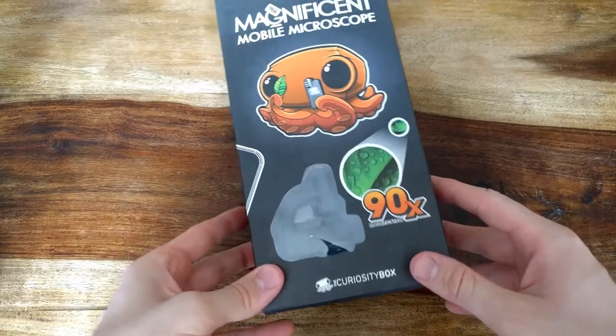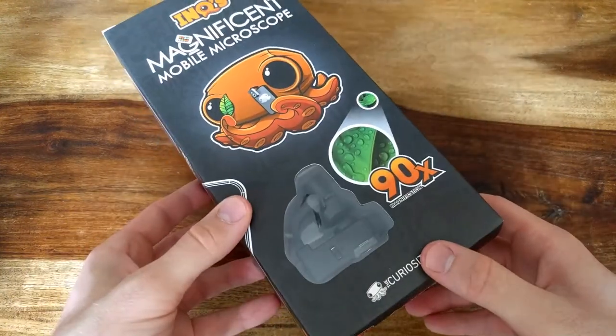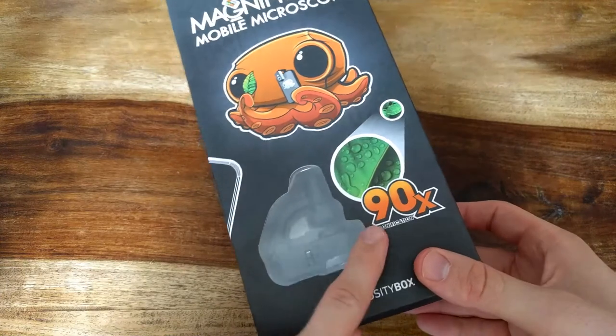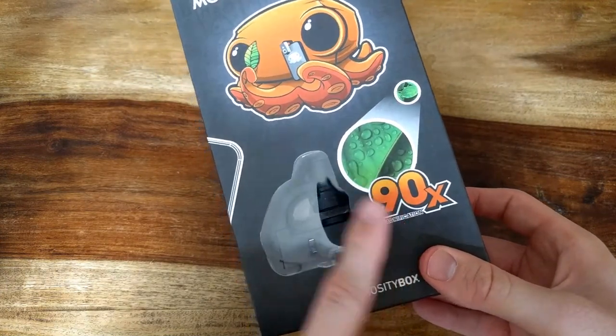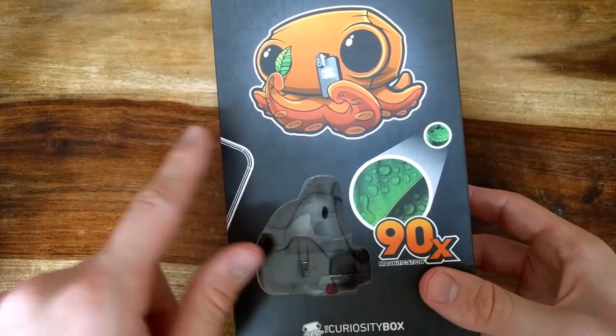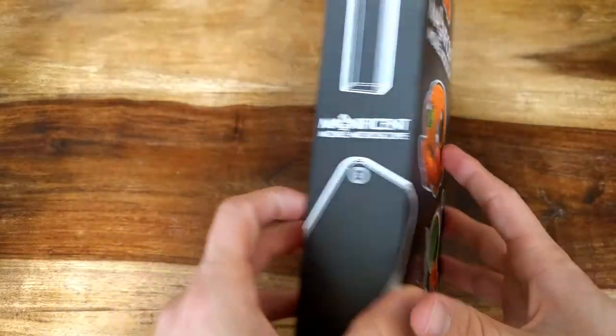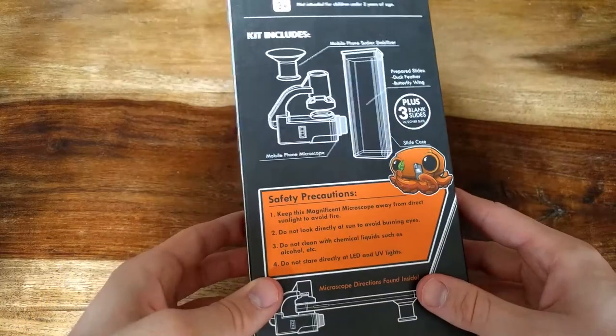This was a review of the magnificent mobile microscope by Curiosity Box. As you saw, it actually magnifies a lot. I don't know if it is actually 90 times magnification, but it does make the image look much bigger with great resolution. It is a cool toy for kids to make them curious about stuff, about things physical, and what they're made of, and for grown-ups as well.